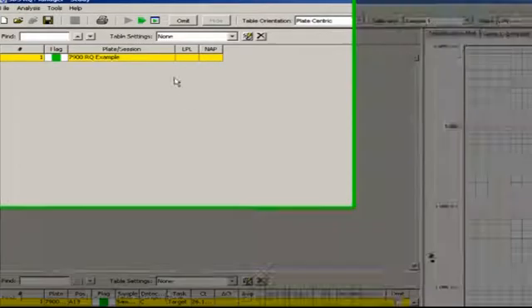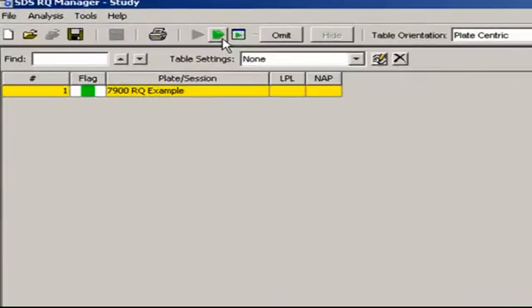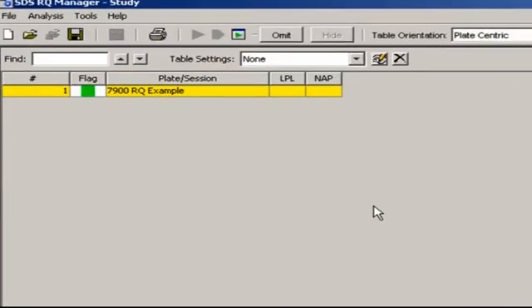To analyze all the data in the study, click the green triple arrow. There's a lot of manipulation you can do within the RQ study file, such as adjusting thresholds or baselines to taste, but for now, we'll simply export the data for analysis in DataAssist.